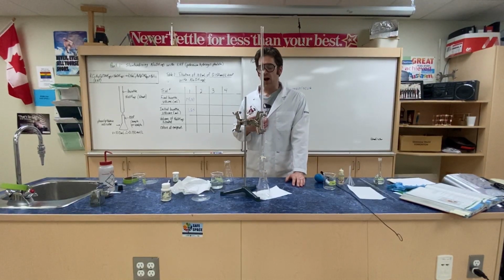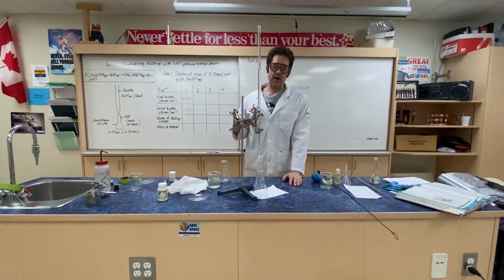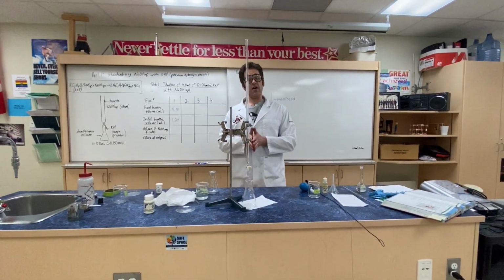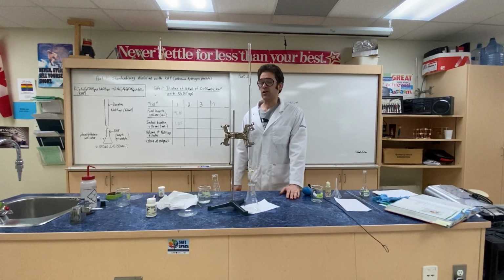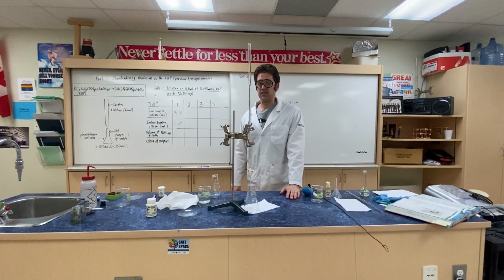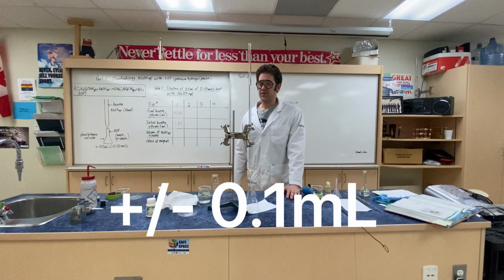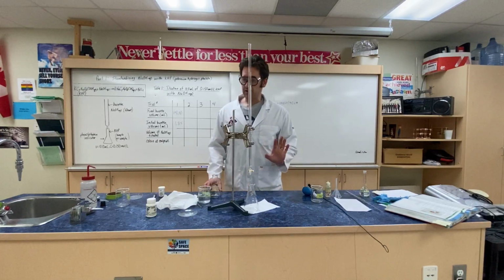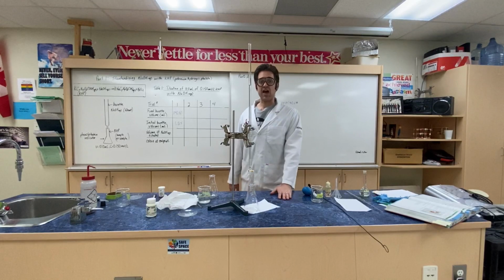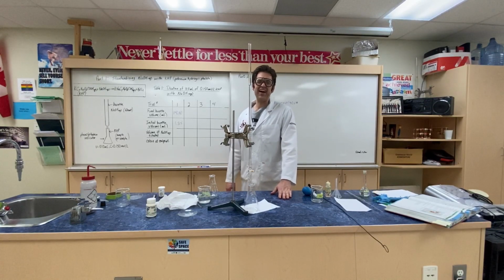When we do this in regular chem, we are constricted by time. Those of you in IB and wanting to continue in IB, how close do each trials have to be, Zdog, if you're going to continue next level? Between 0.1 or 0.2? Plus or minus 0.1 milliliters. Yes, you have to be pretty accurate. We're a little more lenient with the 20s. I think sometimes we're just happy we get through the lab in time.